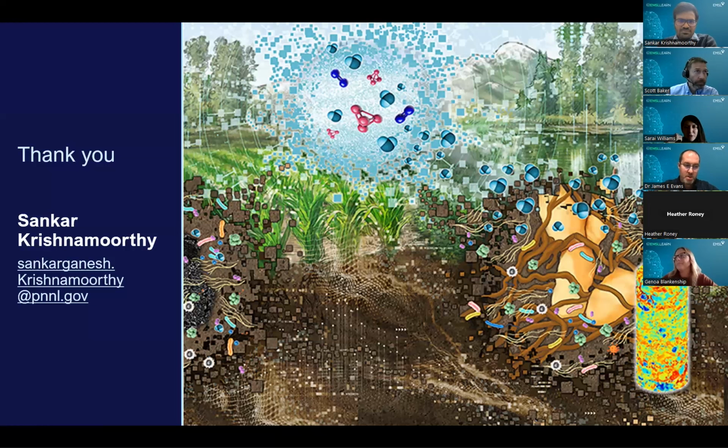Is that a nanoPOTs question? You will know better than I will. Okay, so the work I was talking about today is bottom-up proteomics. However, we have done native proteomics and top-down proteomics. But for bottom-up proteomics, if the salt isn't covalently bonding, we will definitely use that during our reduction. And we do use DTT and TCEP for our reduction agents. Hope that answers your question.